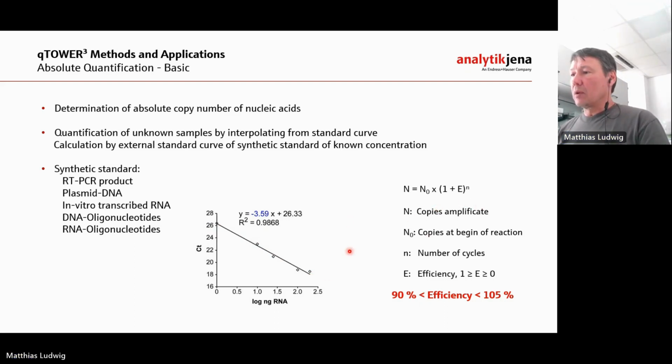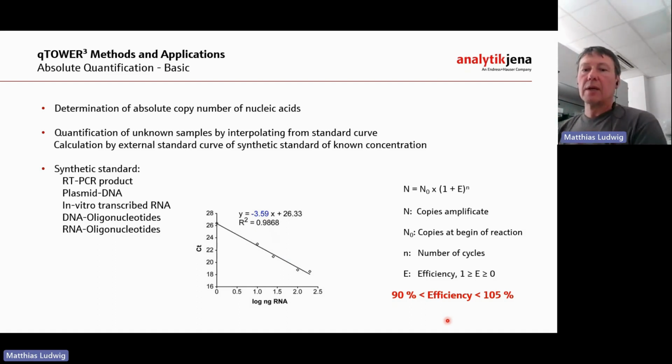All this information goes into the formula, and then the software calculates for you not only the R square, but also the efficiency of this PCR, and this could also help for your assay design or your PCR protocol, and then you get an idea how well my PCR is working.